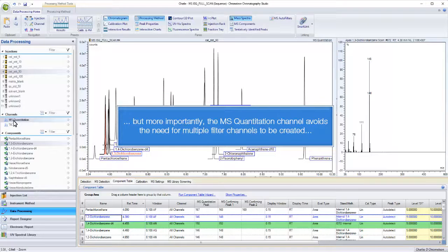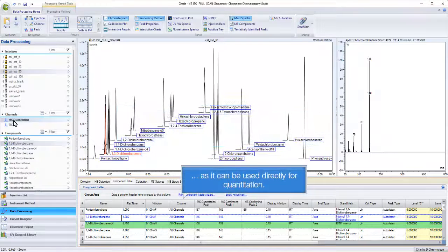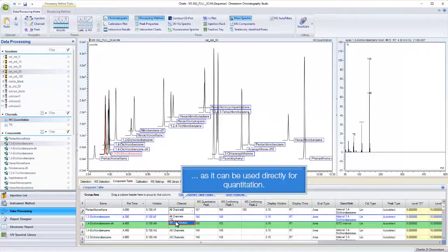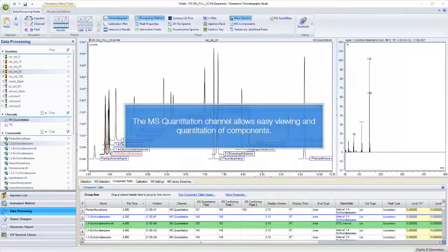The MS quantitation channel avoids the need for multiple filter channels to be created, as it can be used directly for quantitation. The MS quantitation channel allows easy viewing and quantitation of components.